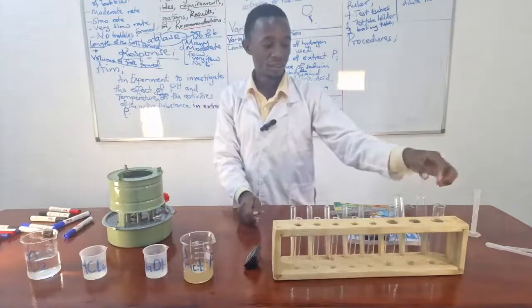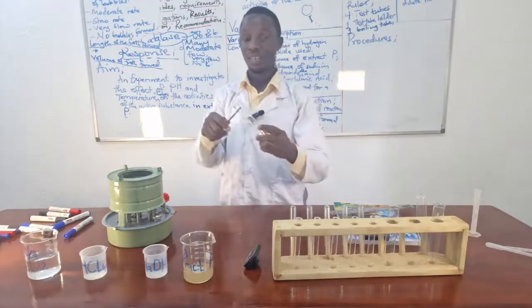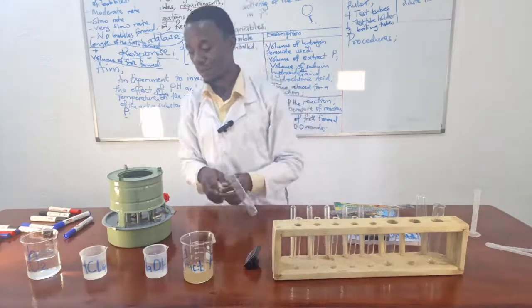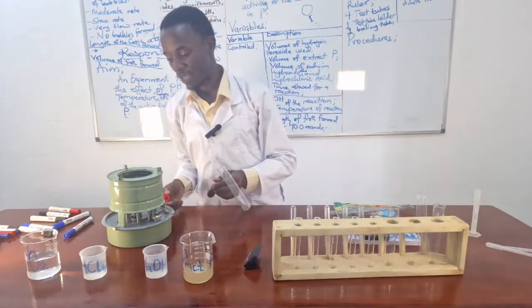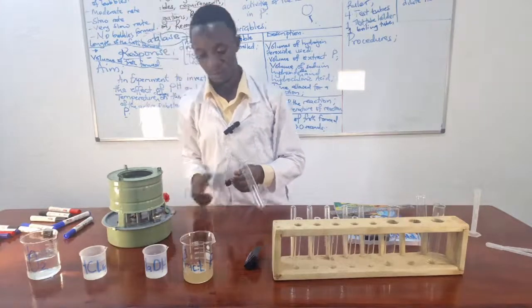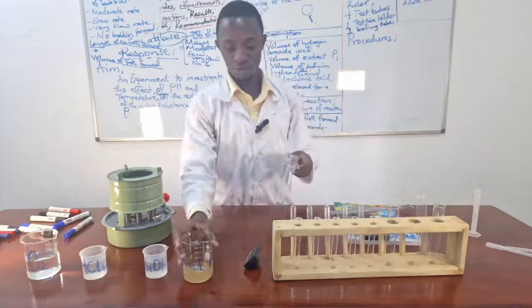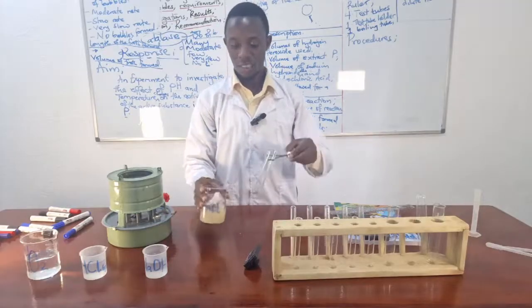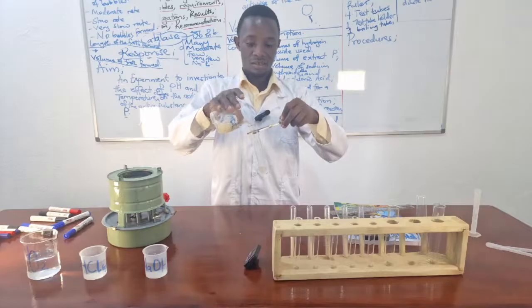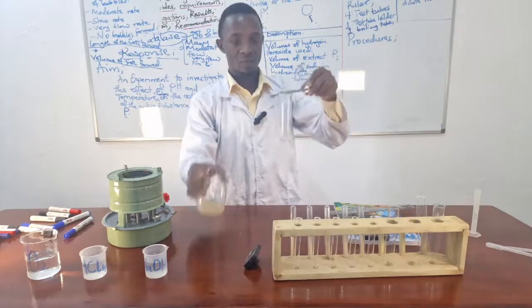I'm going to boil part of the extract, from which I will measure using one of the test tubes. So I'm allowing time for my stove to stop bringing out soot. I'm going to boil part of the extract. I think this will be enough.